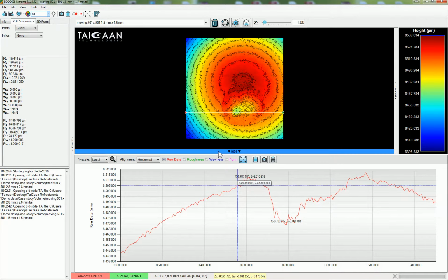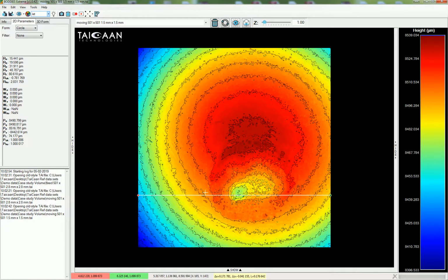Well, how do we determine the volume of the material here? Well, a very simple action is to remove the underlying sphere from the data. So how do we do that? Well, if we fit a sphere to the data set as shown, we're going to get a value, but the value is going to be affected by the presence of the crater and the data associated with that. So clearly the best thing to do is to remove the crater from the calculation.